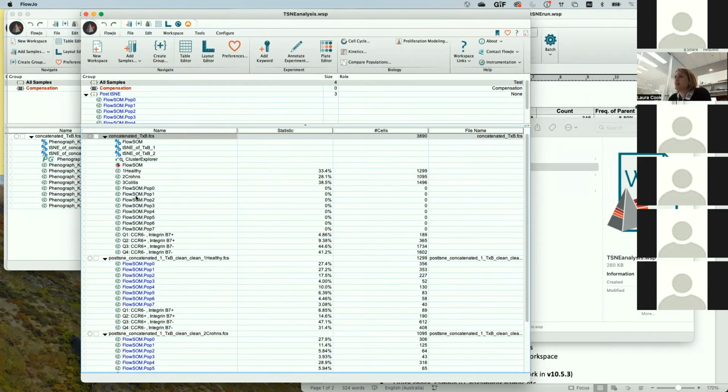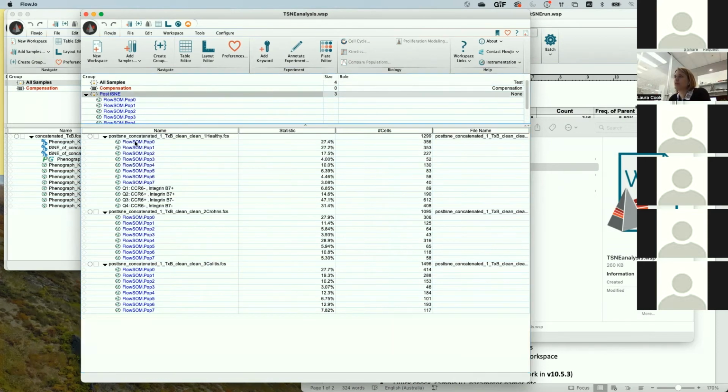Yeah, it's easier to work with them as an FCS file because that way it's treating them as an independent sample, and if you create the gates here, you can just copy and paste them everywhere. It's just a lot easier and cleaner because then your frequencies of parent are of that total population from those cells.